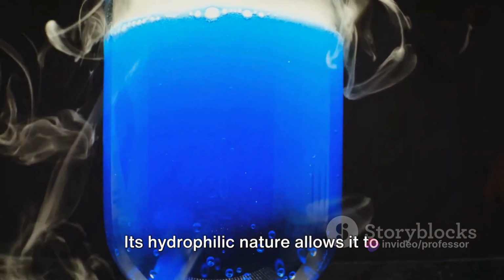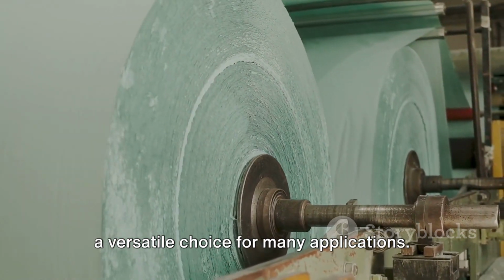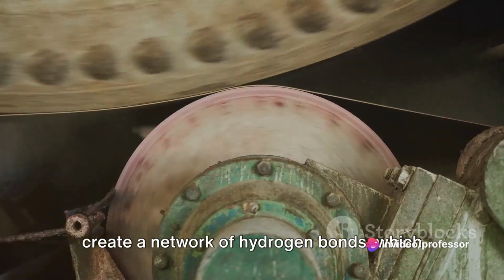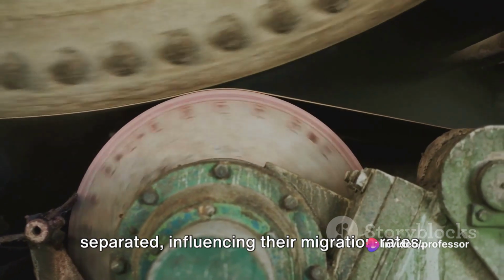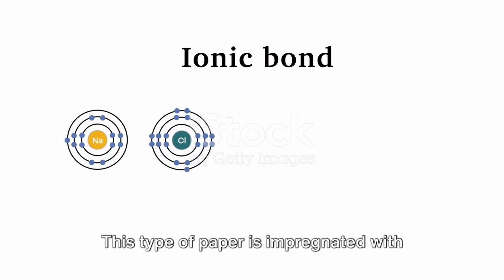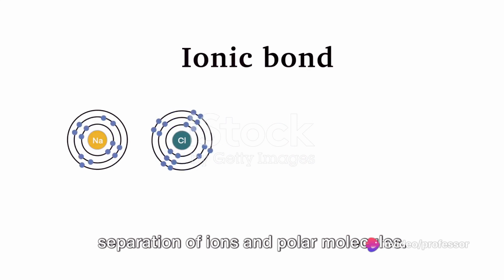Its hydrophilic nature allows it to absorb a wide range of solvents, making it a versatile choice for many applications. The water molecules in the cellulose create a network of hydrogen bonds, which can interact with the molecules being separated, influencing their migration rates. Next, we have ion exchange paper. This type of paper is impregnated with ionic substances to allow for the separation of ions and polar molecules.